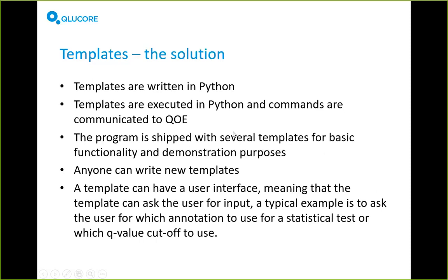A little bit more details about this then. As I said, these are Python scripts. Templates are written in the Python language, and that was chosen because Python is a very modern, very well-established language today. It's modern and object-oriented. It's easy to learn, and it's also widely spread out there. And it's a very good language for this type of program control, or this type of scripting. So Python is an excellent language for this.